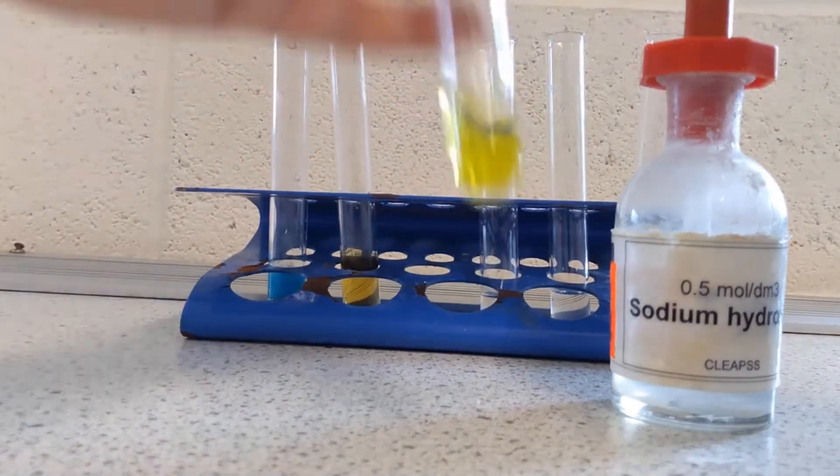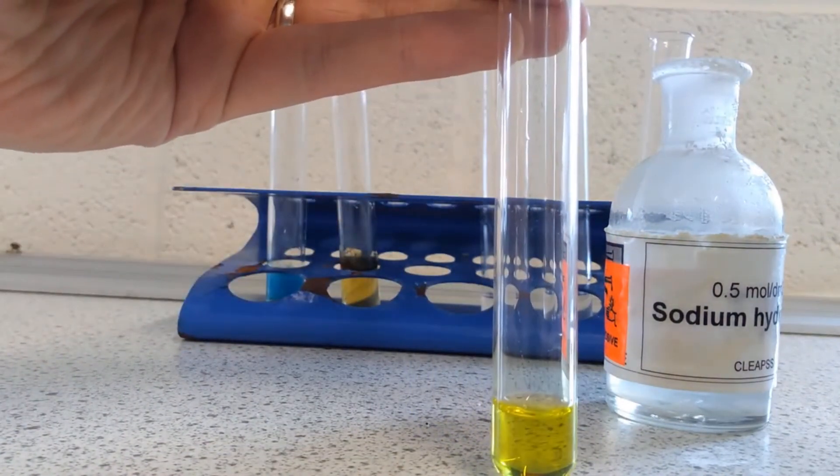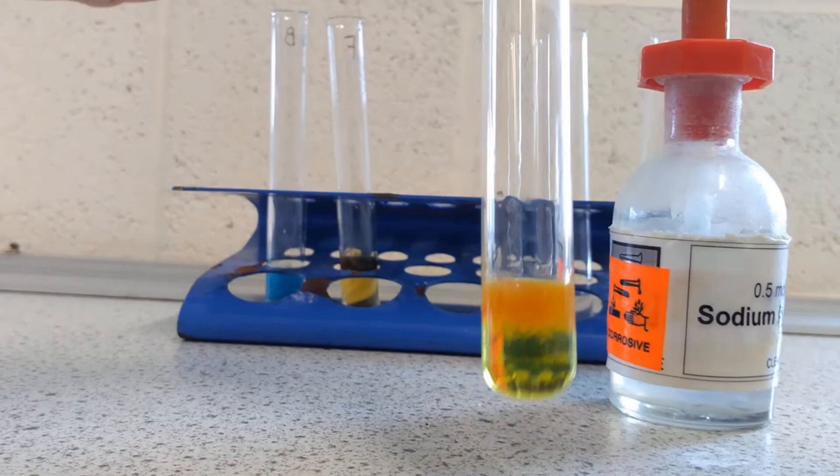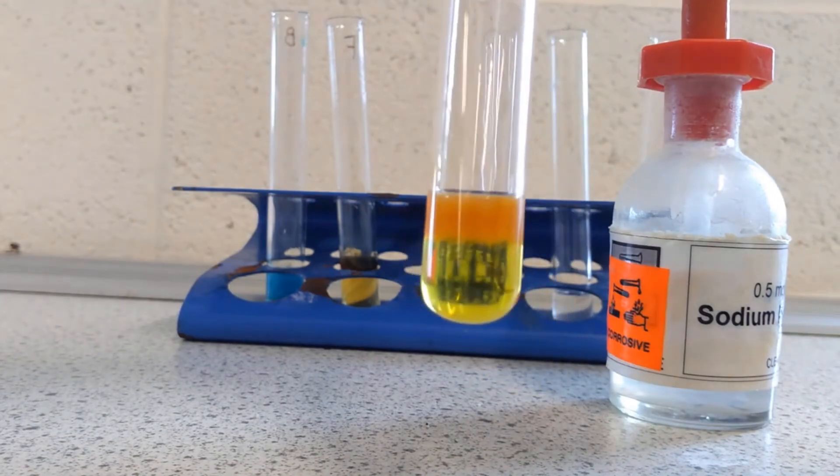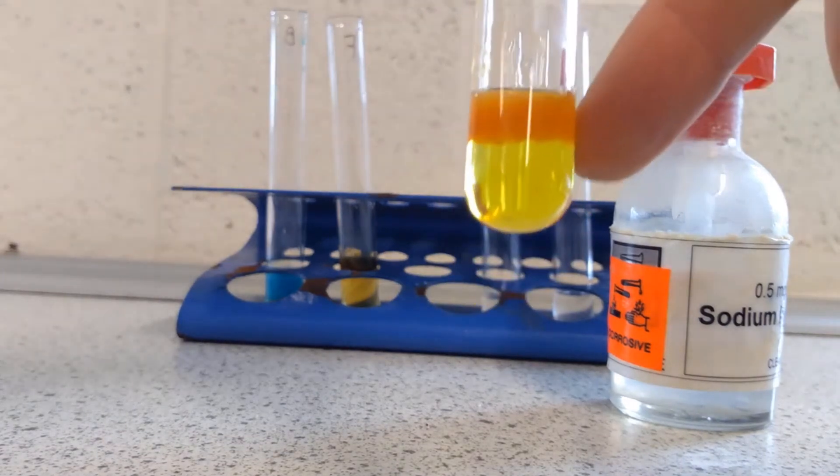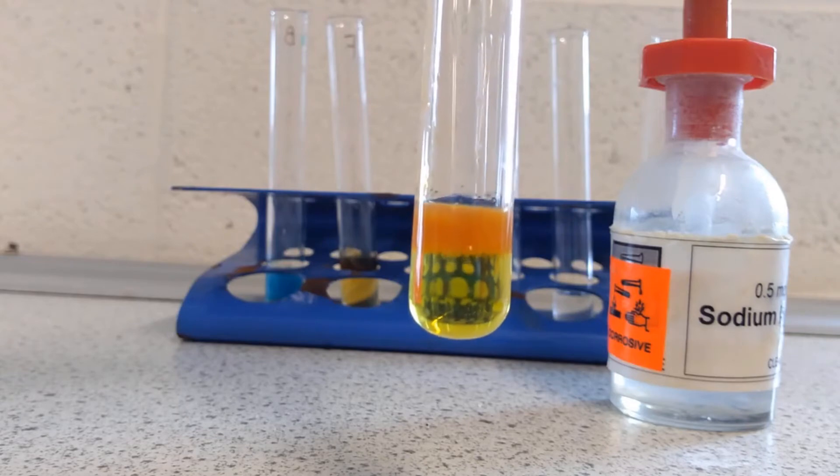And then in contrast to that, iron 3 plus ions produce a much more orangier colour. So if you think about rust, that's hydrated iron oxide and it's iron 3 oxide, so this is rusty coloured because that's the colour we would expect all iron 3 compounds to turn.